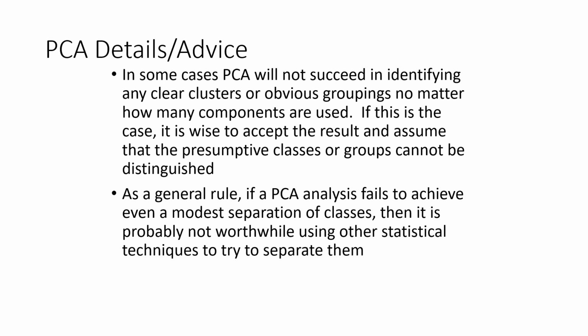PCA is a way of essentially assessing whether you are pursuing a useful line of inquiry or whether it's time to perhaps stop and think about another type of experiment. If you cannot separate your 2 or 3 classes based on a PCA plot, and that separation is non-obvious, then applying more and more statistical techniques can actually get you into more and more trouble. However, there are some tricks that can help tease out separations that are not quite as obvious to the eye as would be expected.